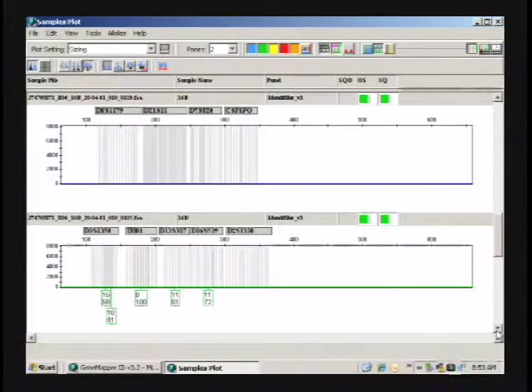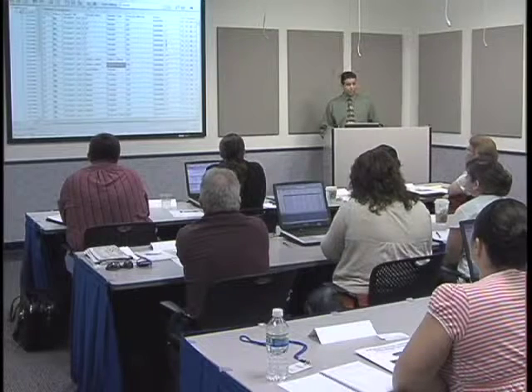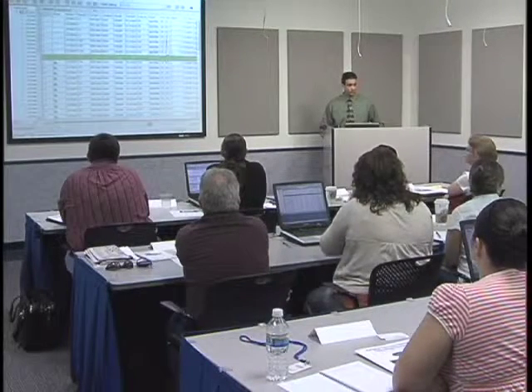Rob, when we made both of them ladders, they typed. Oh, when you average the ladders? Okay. And they did in the back. I also combined both run 1 and 2. I labeled every ladder and everything's fine. Oh, okay. I've encountered stuff where some labs won't average ladders, so some people do and some people won't. Yeah. I didn't know which, so I just chose not to. We just import one. Right. Some labs just use one ladder, and some labs don't.